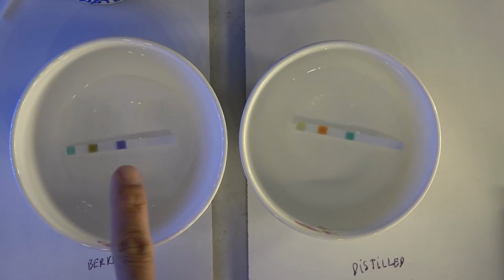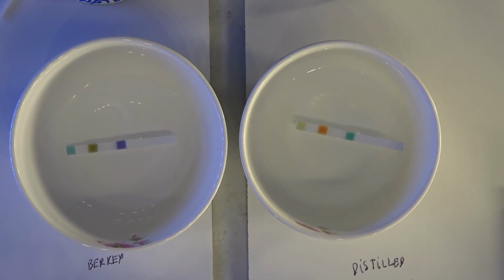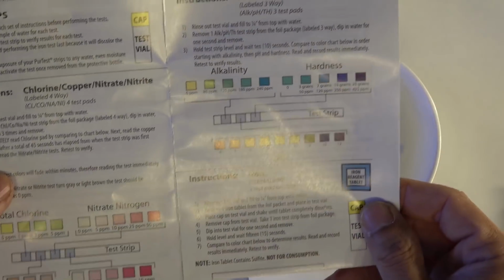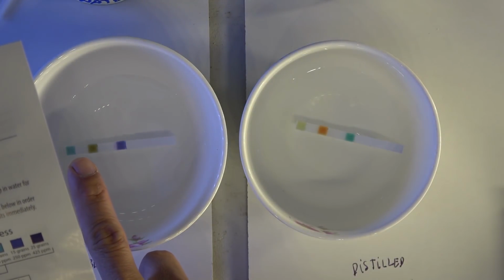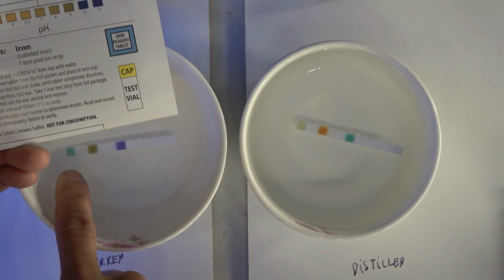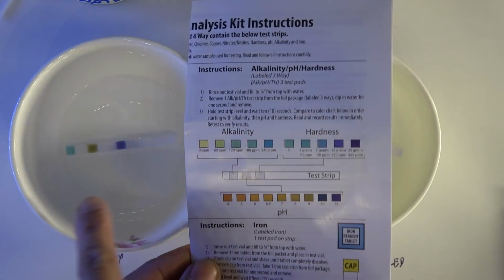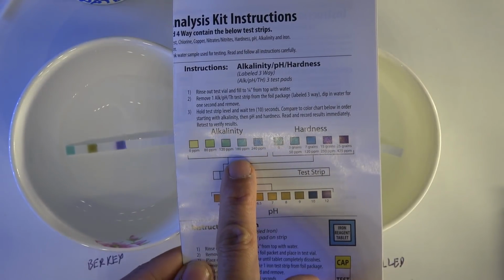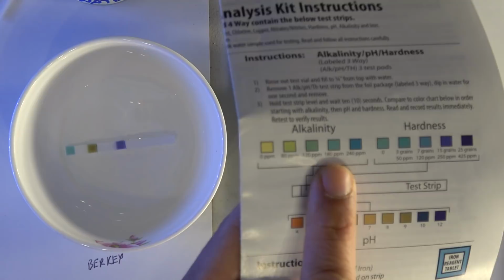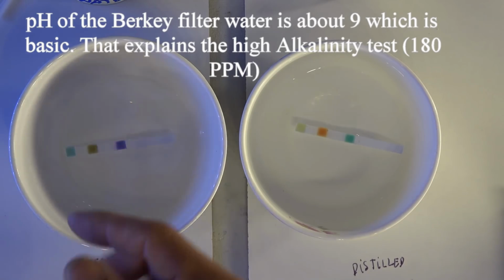You take a look at the color on this side, it is completely changed and looks different than the distilled water. So there's a lot of changes on the Berkey water here. Let's take a look at the charts. The first one is the alkalinity, which looks more like blue, turquoise blue. So let's see. That blue looks more like this one here, which is 180 parts per million alkalinity. The middle one is the pH.